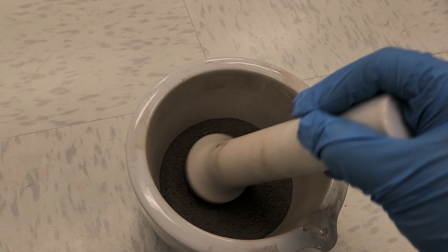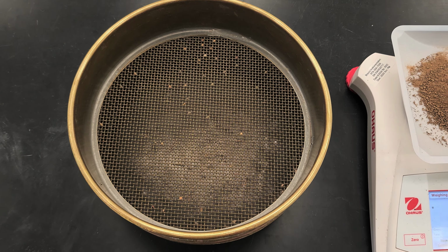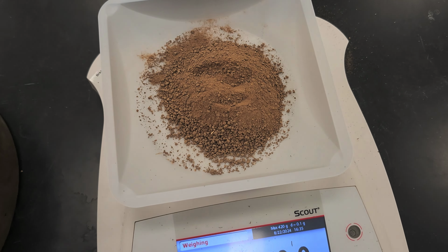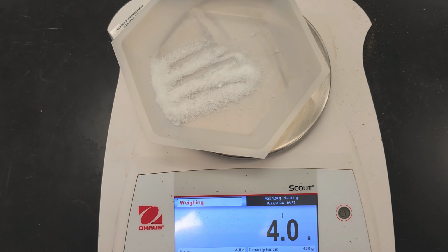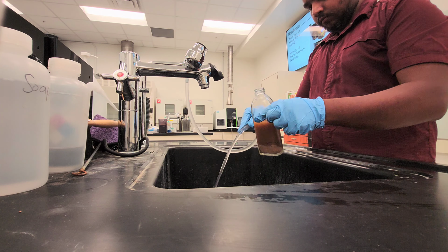First, we need to grind our soil sample using mortar and pestle. Soil samples were passed through a sieve having a diameter of 2 mm. 50 gram air dried soil will be used. 4 gram sodium metaphosphate will be mixed with the soil in a dispersing bottle along with DI water.